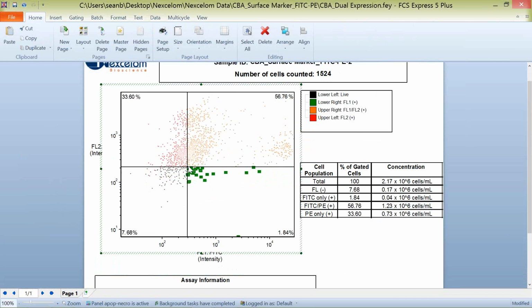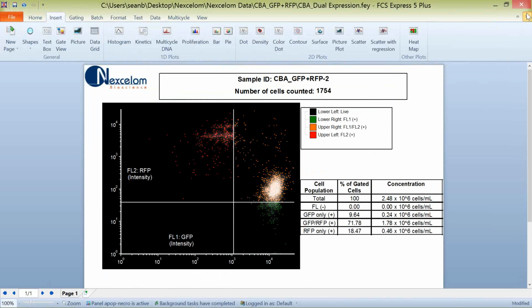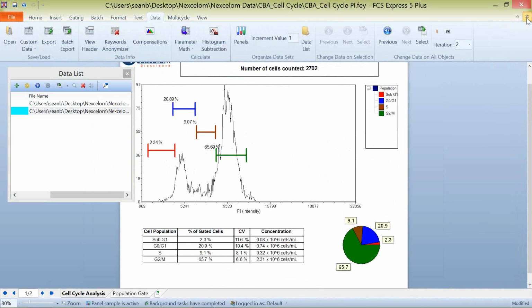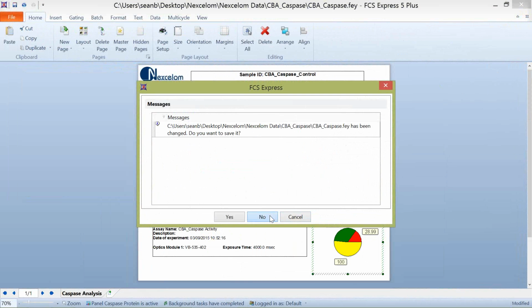We've seen in the past working with Nexcelom customers, they'll generally have a lot of layouts open to work with data. They're not going to ever notice any kind of slowdowns working with them now. So I'll take this moment before we go over creating some layouts and how to access a lot of these new features. Are there any questions that anybody had before we move forward actually creating some layouts?